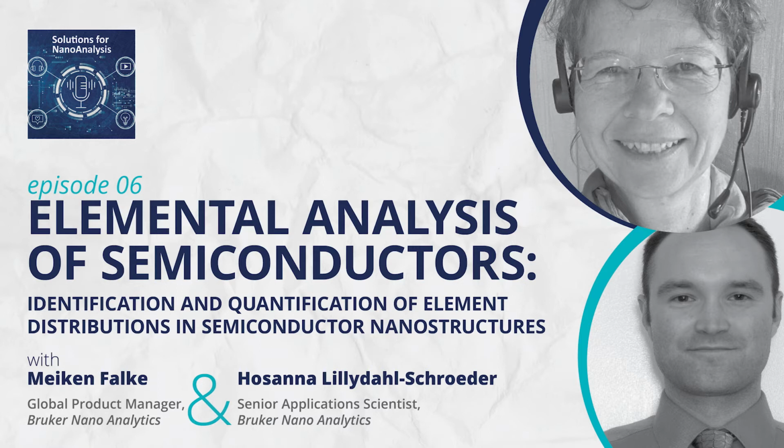So the EDS part is a bit of a funny story. I was lucky to be one of the first setting up user facilities for aberration-corrected microscopy. And there we had really high-end aberration-corrected microscopes. That was at the SuperSTEM laboratory in the UK. And as a spectroscopy technique there, we used EELS. Now, EELS is a really powerful technique, and it comes with really high energy resolution now, reaching infrared spectroscopy level.